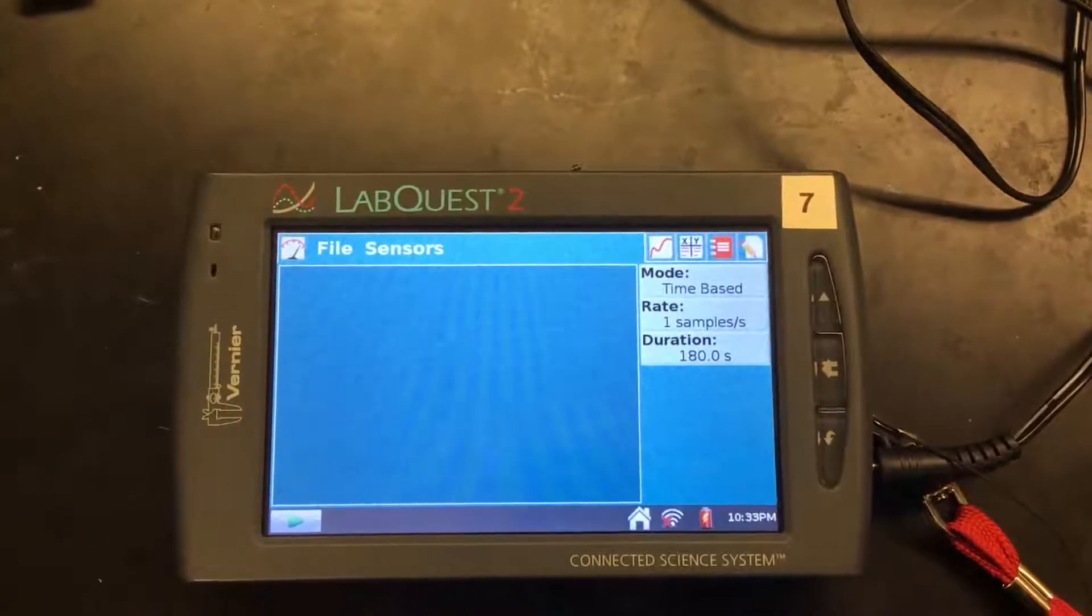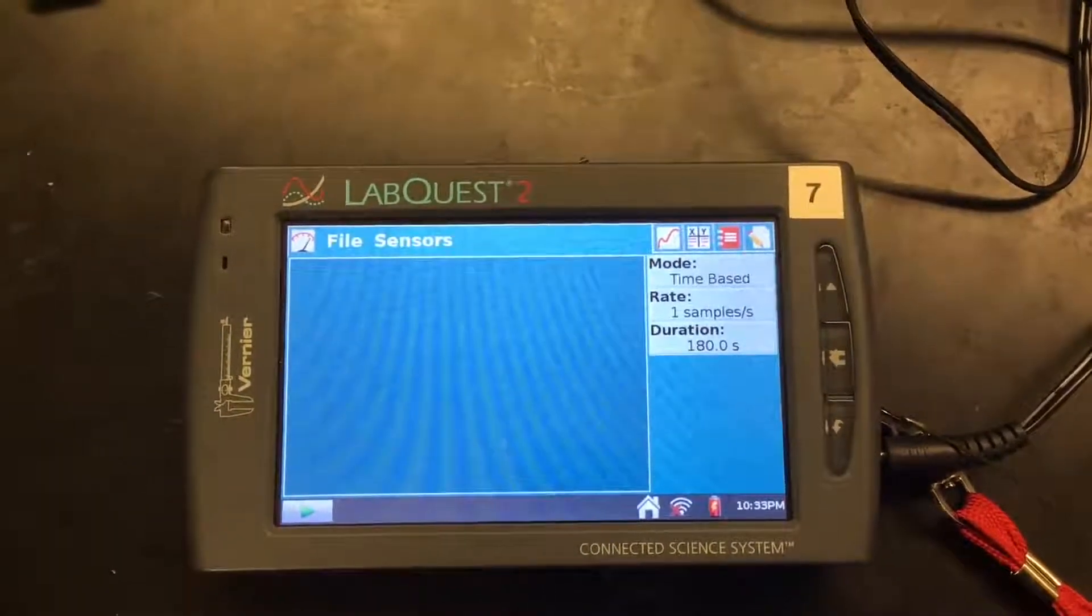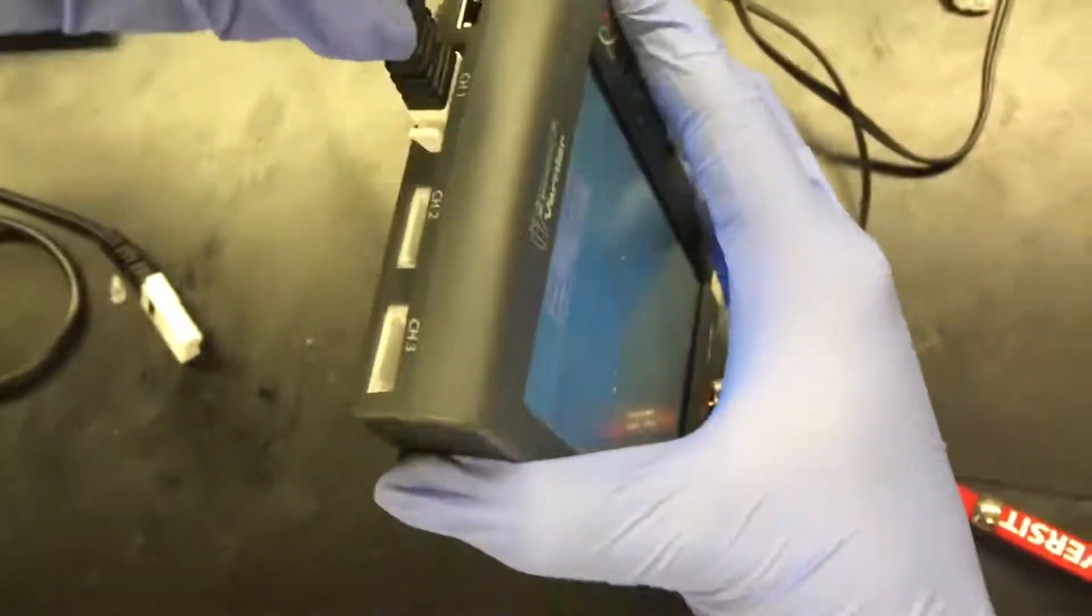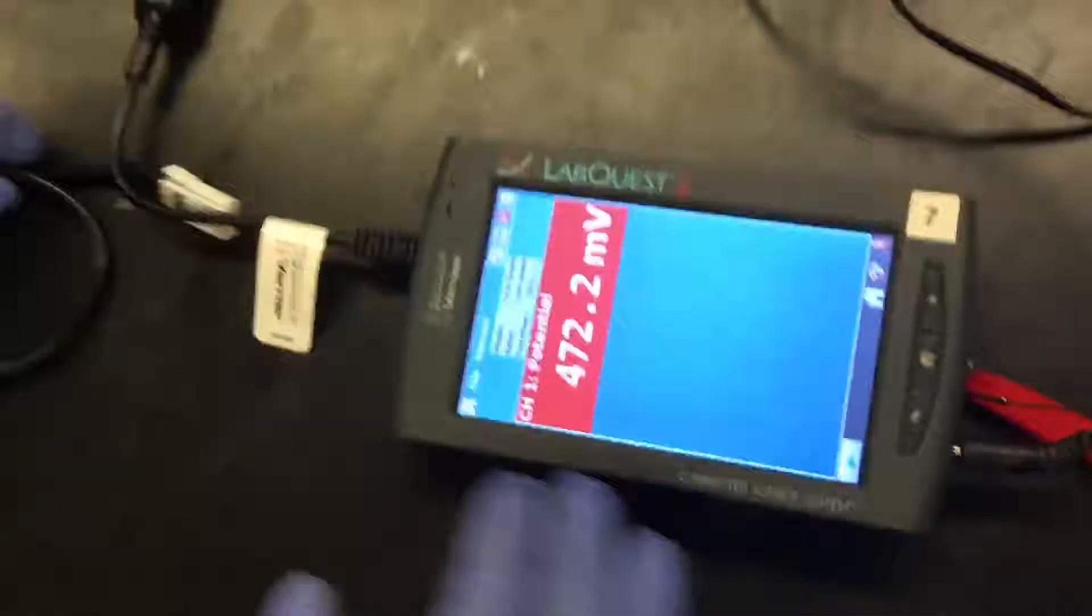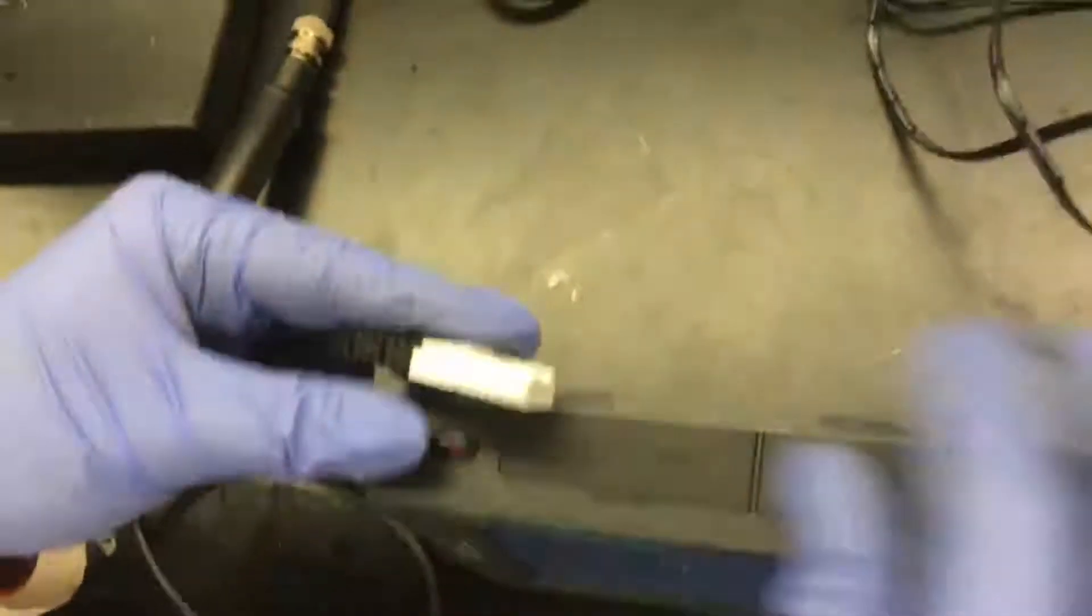This is the Vernier system that we will be using. Eilish is going to plug in first the redox probe, which is similar to the pH probe that you will be using. It's in channel 1. And then she's going to be plugging in the drop counter, which goes into digital 1.